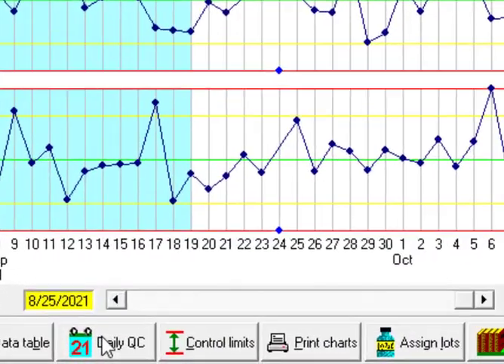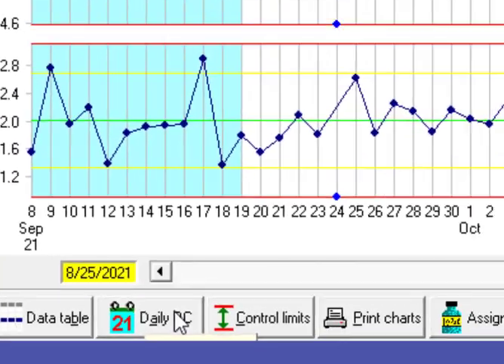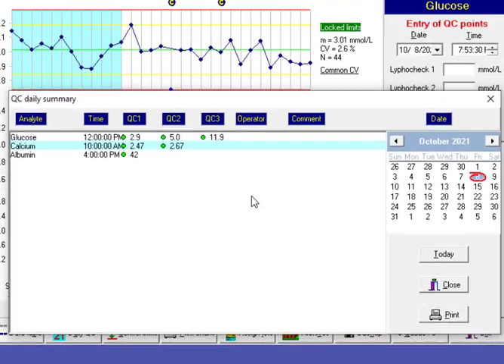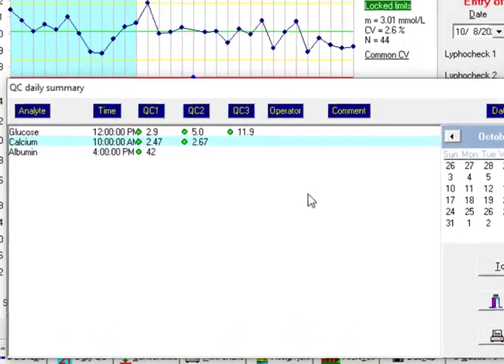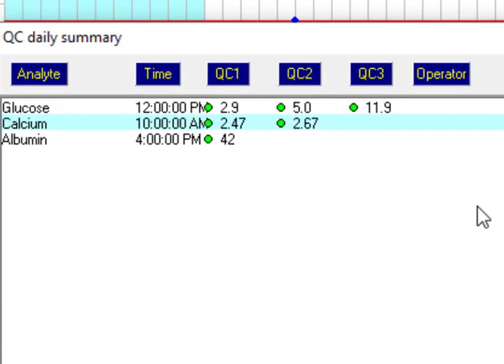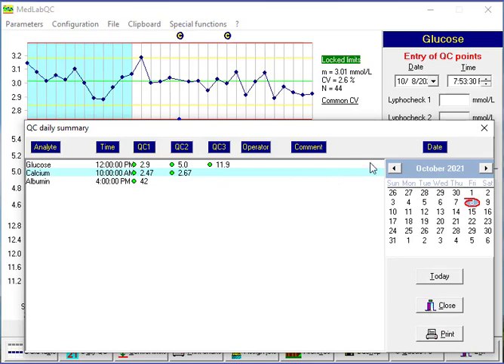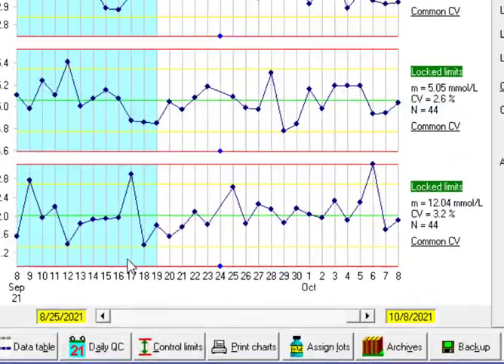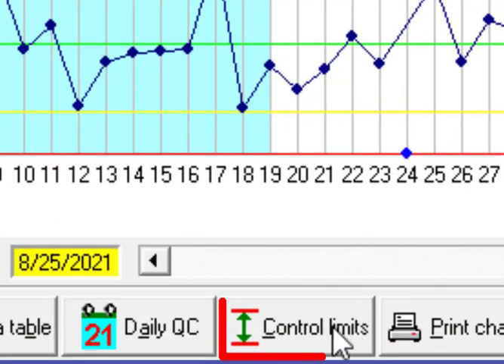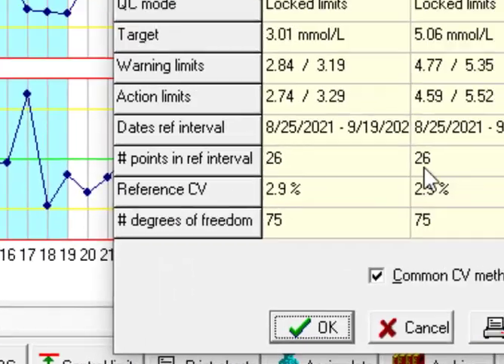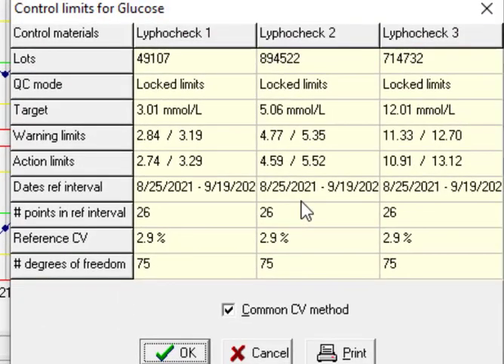We have daily QC. For each day we have some data that will be shown here. Control limits that is calculated when we use lock limits that I explained in the part of special functions.